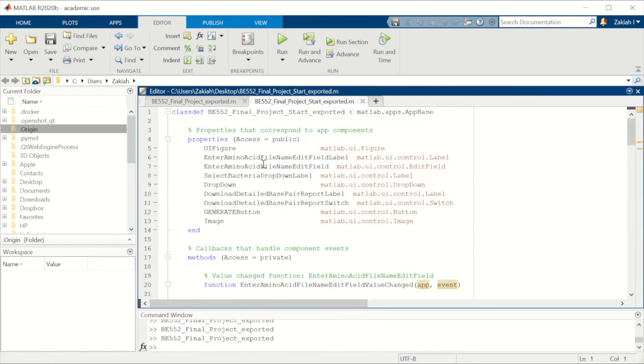In the future, we definitely would like to convert this program from MATLAB to Python so it's more accessible, like the code you've seen previously in the video.